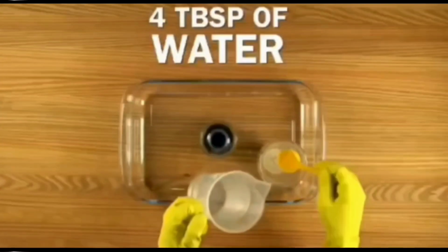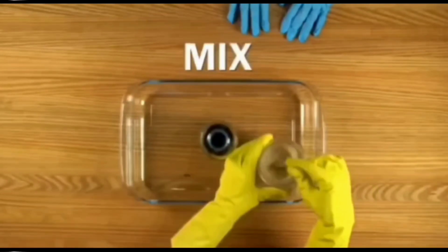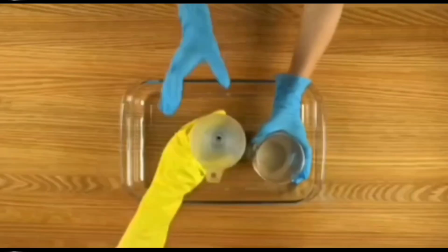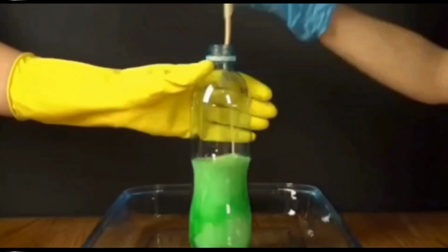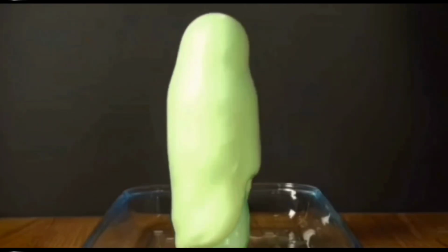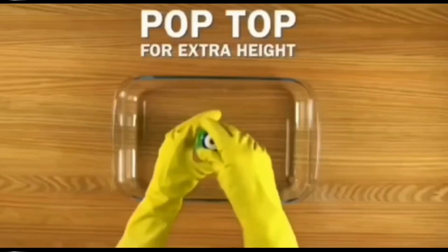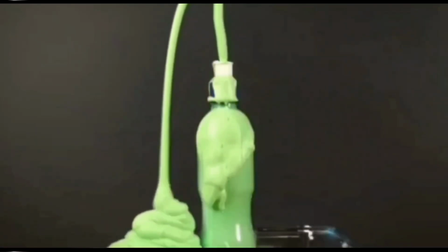What happened in the reaction? Hydrogen peroxide breaks down naturally but very slowly. The catalyst speeds up the reaction without being used up. To sum up, the elephant toothpaste experiment demonstrates the rapid catalytic decomposition of hydrogen peroxide into water and oxygen gas. The presence of a catalyst significantly increases the reaction rate, producing a large volume of foam and releasing heat. This experiment clearly illustrates the role of catalyst, exothermic reaction, and gas formation in chemical reaction.